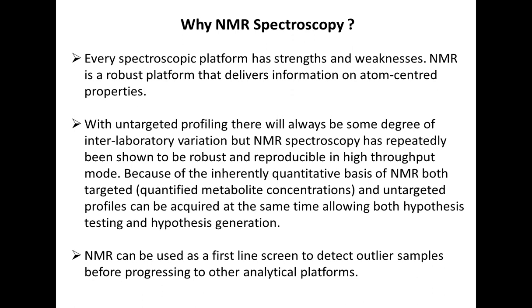Claudio very nicely described the difference between untargeted and targeted profiling. And when we consider untargeted profiling, there's always going to be a little bit of interlaboratory variation. But having said that, NMR spectroscopy has repeatedly been shown to be reproducible and robust in a high throughput mode. So you really can use it and share your data between laboratories. So that's another attractive feature of NMR.